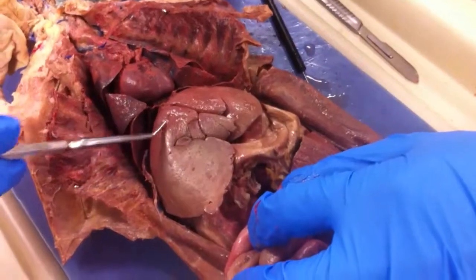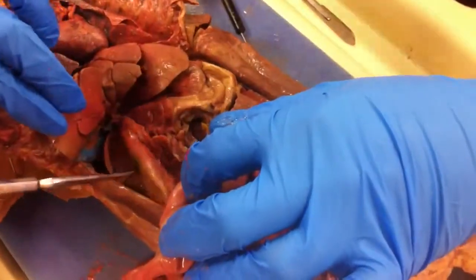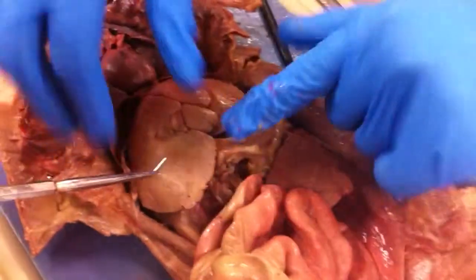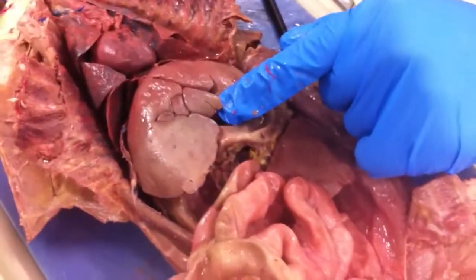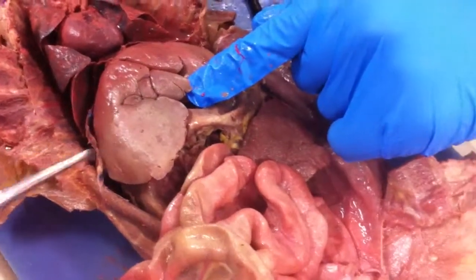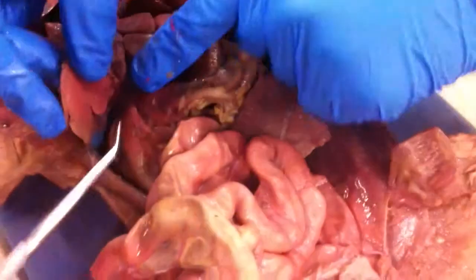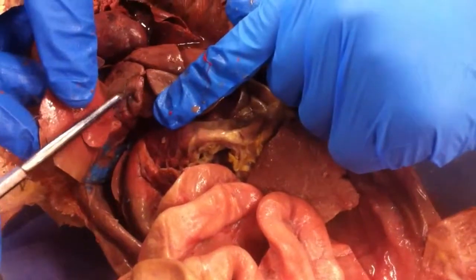Here's the liver. It's composed of 6 lobes. The quadrate lobe, the left medial lobe, the left lateral lobe, the caudate lobe, the right medial lobe, and the right lateral lobe. Its functions are chemical synthesis, detoxification of harmful chemicals, and storage of metabolic products and bile. And right here between the liver, you have the gallbladder. It's that little balloon-like structure.